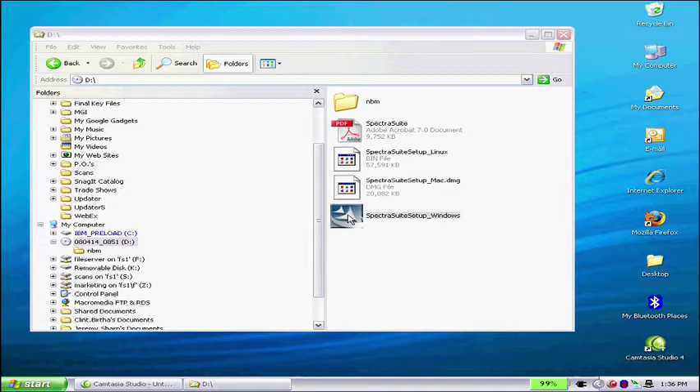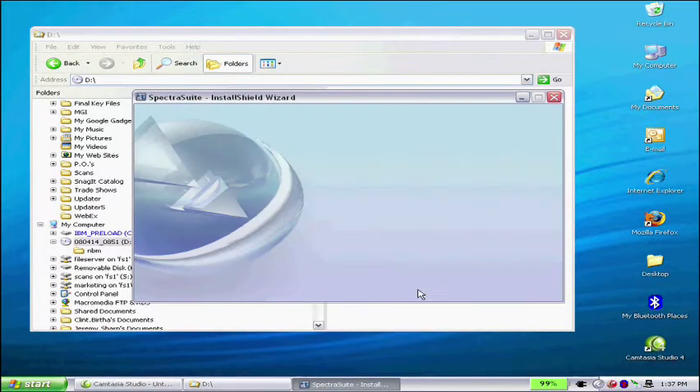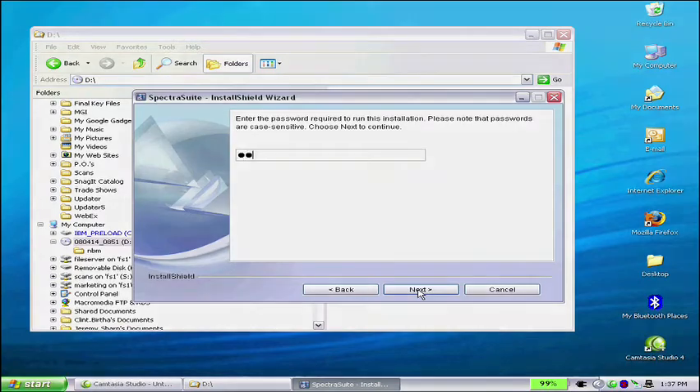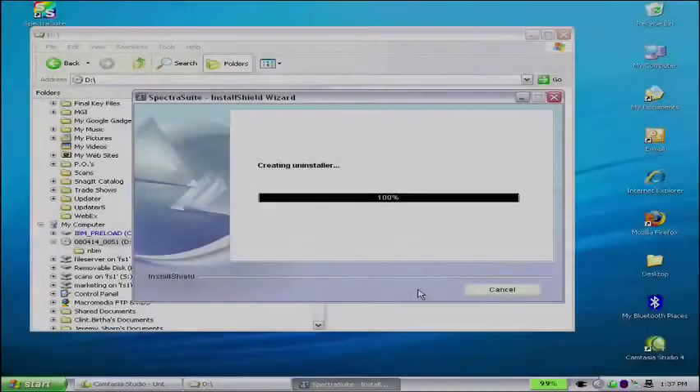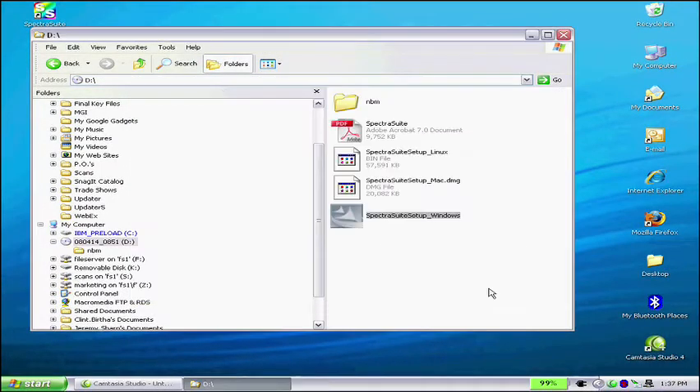This activates the InstallShield wizard. Follow the prompts until installation is complete. This should take no more than a minute or two. Now that the software is installed, it's time to connect your Spectrometer to the computer.